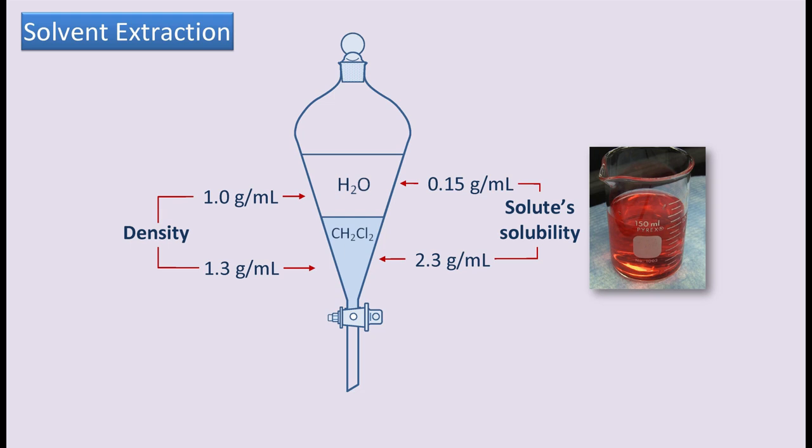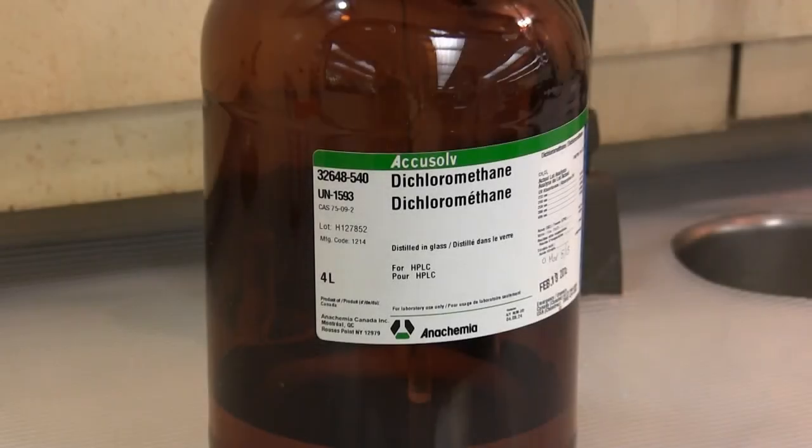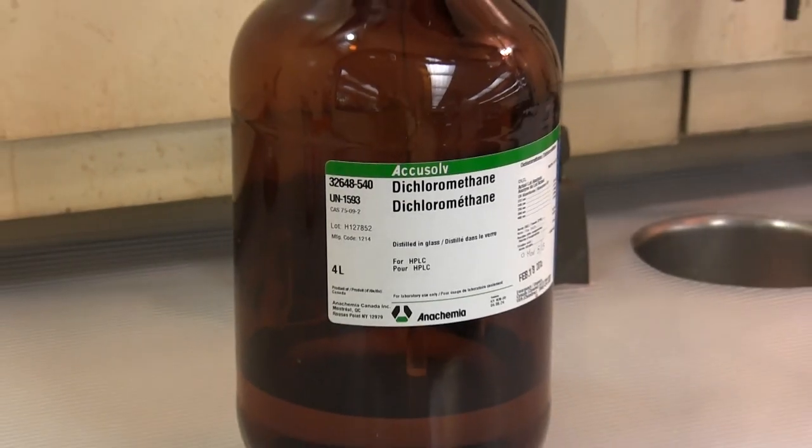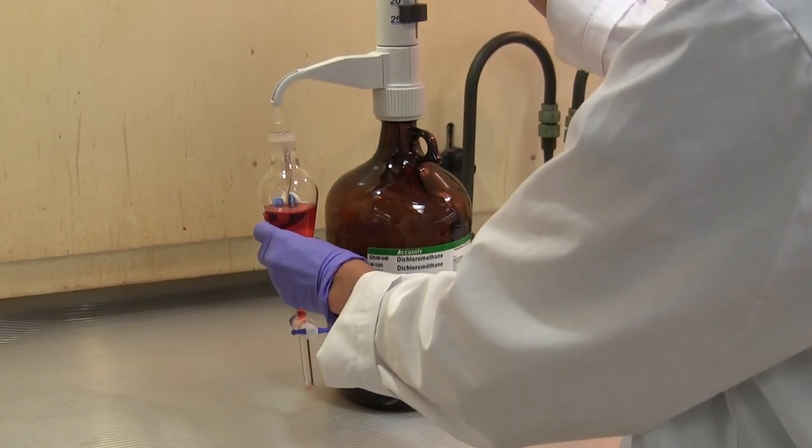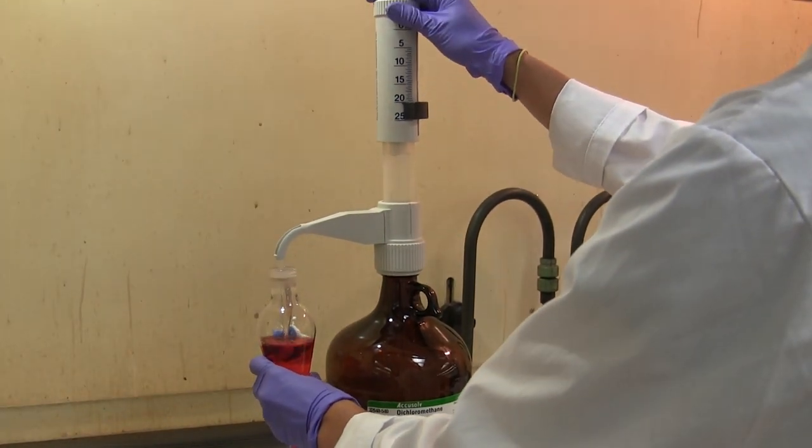Indeed, it is good practice and prudent to always check the densities of solvents used in solvent extraction so that we know which layer is on top and which layer is on the bottom. So we begin the extraction process by adding the required amount of dichloromethane to the aqueous solution in the sep funnel.